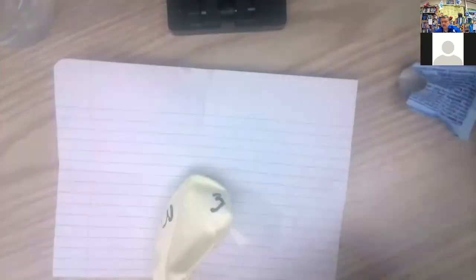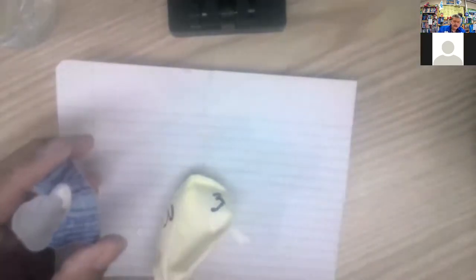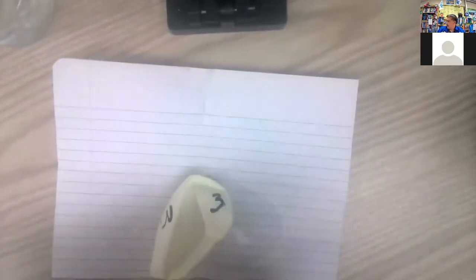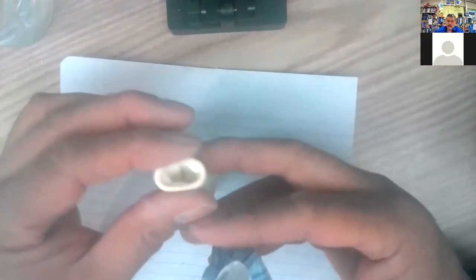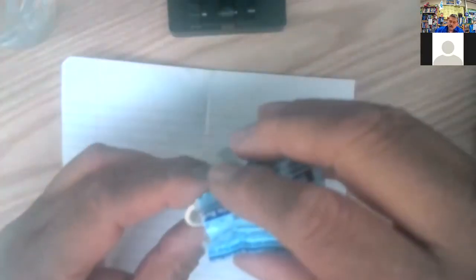So I'm trying to shake all the powder to one end so I can open this up. And there we go. Toss my garbage while I make it. And then let's go and put the other 2 tablets in here. So I've opened up my balloon. Pour that powder.